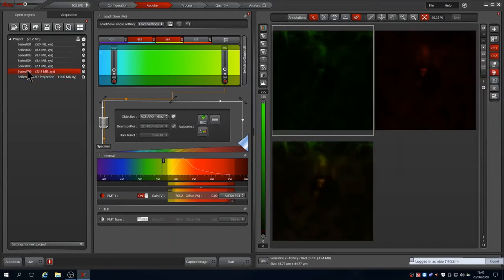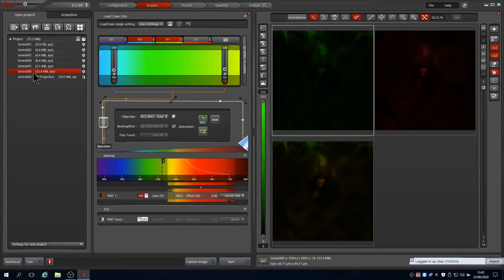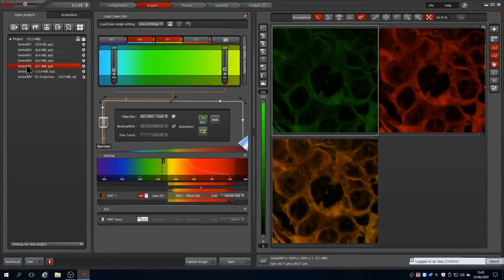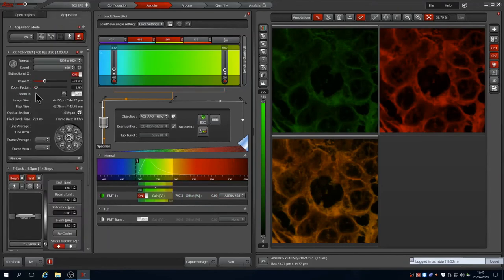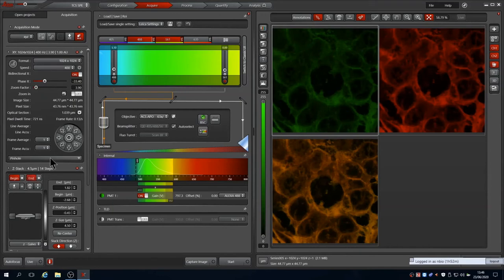If you are continuing an experiment, you can use this to reuse the imaging parameter settings. Select the image in a project, then click the Apply button to load the image parameter settings for it. These settings include laser power, scan size, parameters, etc.